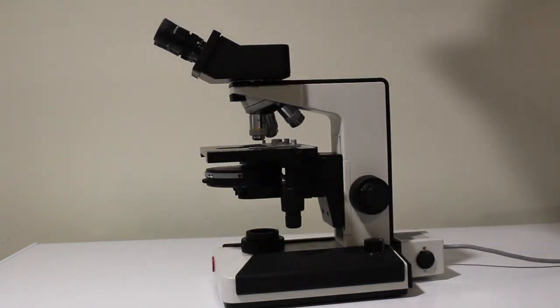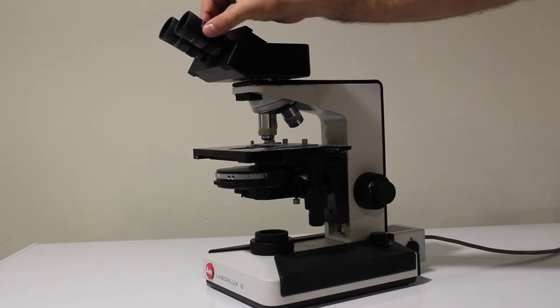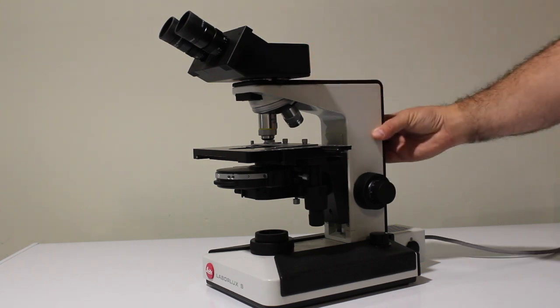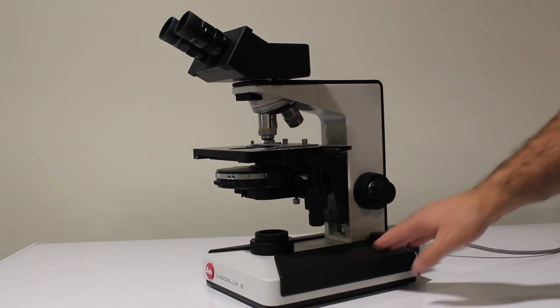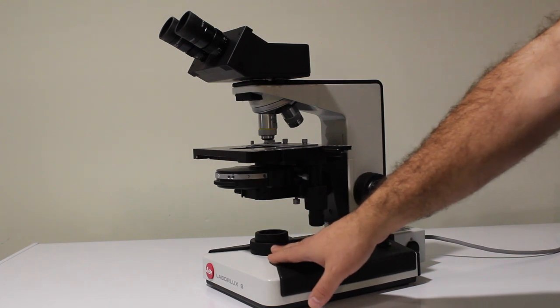So when I remove the cover, you can see what we have here is a pretty typical microbiological microscope. If we start at the top, here we have what's called a binocular head, binocular because it has two eyepieces. We have the armature, which is the component that is supporting the head. We then have the base, which has a lamp in the back, and then some optics that come here to where the illumination actually comes up to the sample.